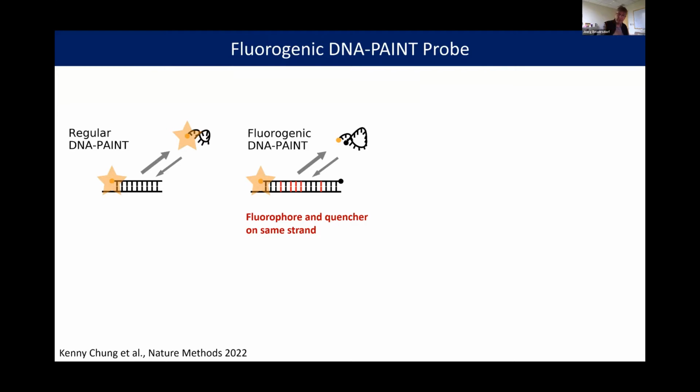that fluorophore. But when it's bound to the docking strand, then it will be stretched out, will be far enough away to not quench the fluorescence, and the molecule will lighten up.